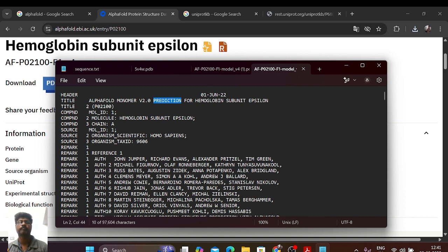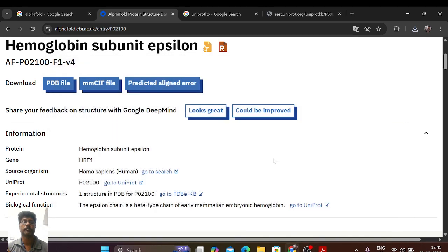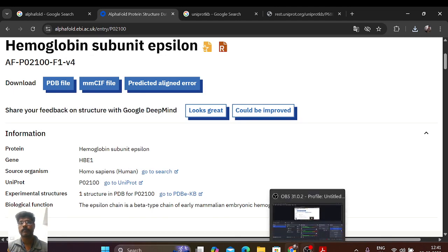At the same time, you can download the PDB retrieved from the laboratory experiment. This is about the experiments. You can submit the PDB file also as a result. Okay, thank you.